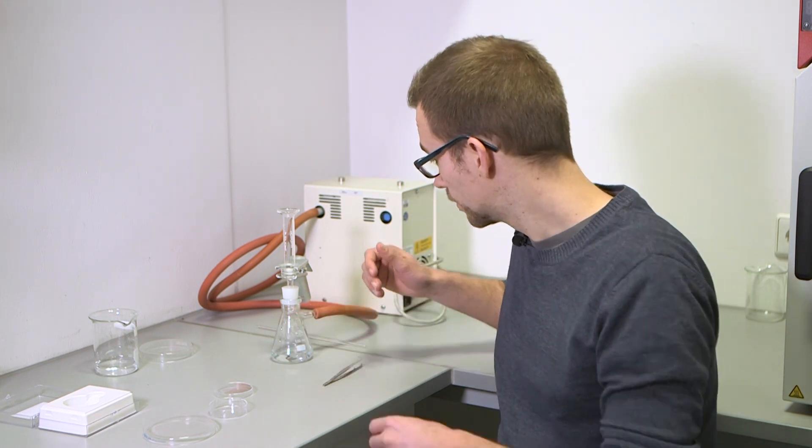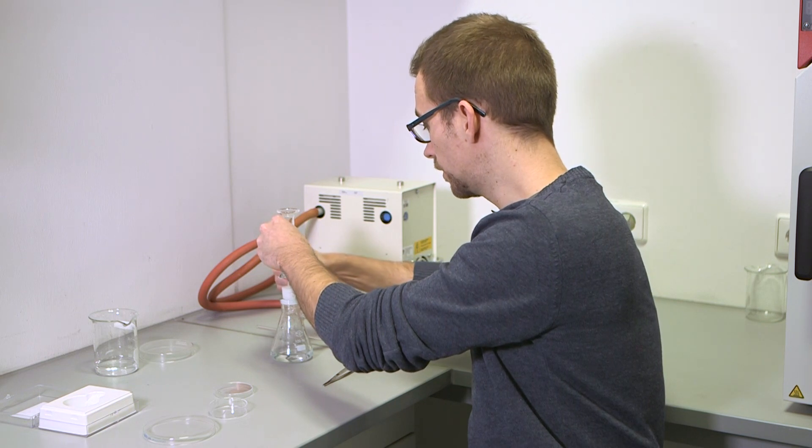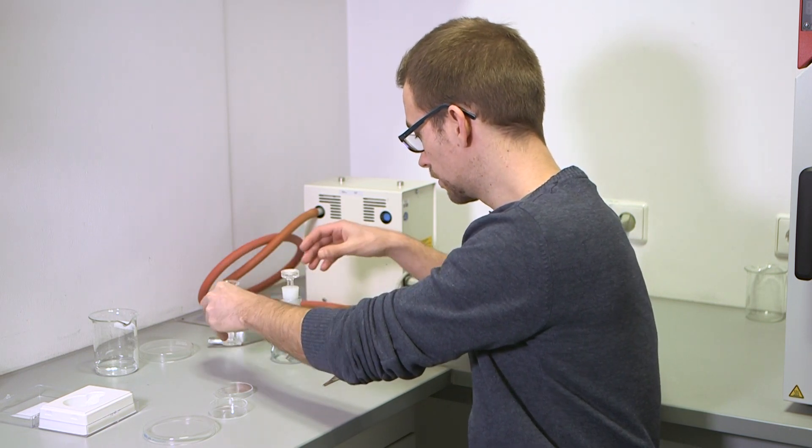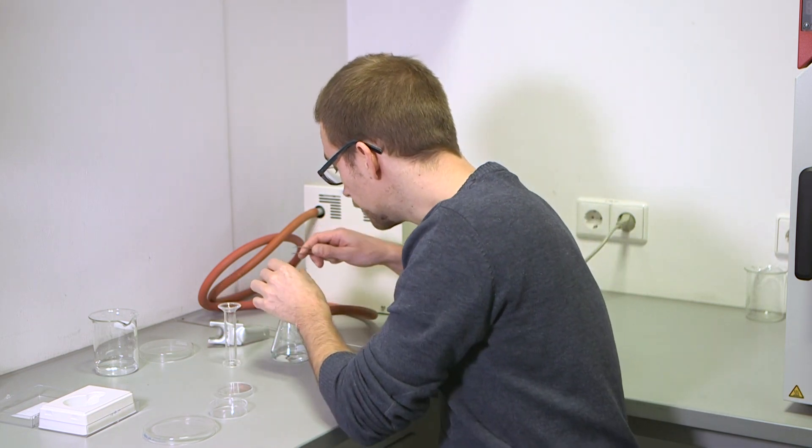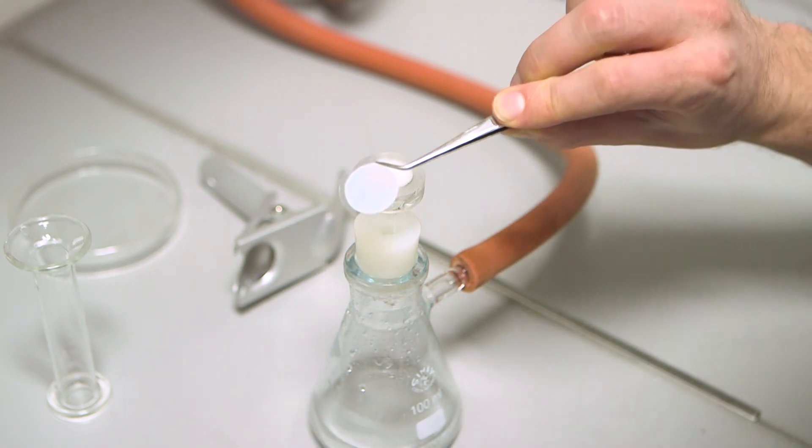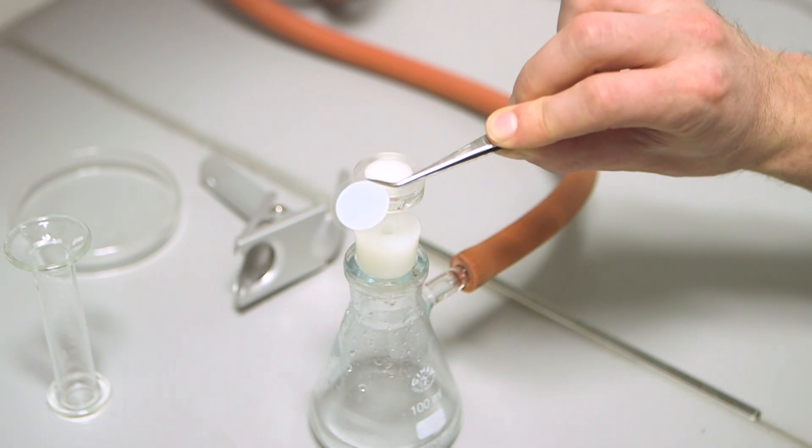After our filtration is done, we can remove the top cylinder by removing the clamp and before we can start our measurement, we're going to take the filter and leave it in the oven to dry.